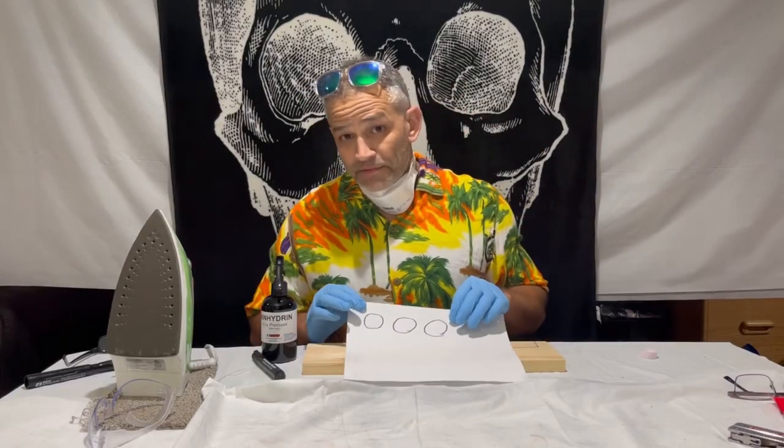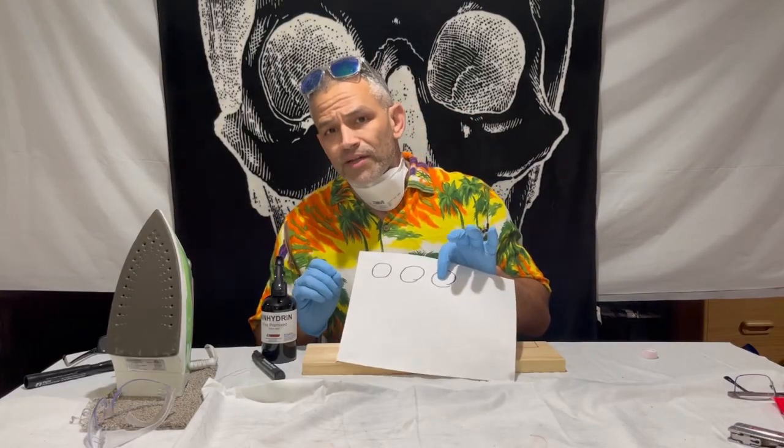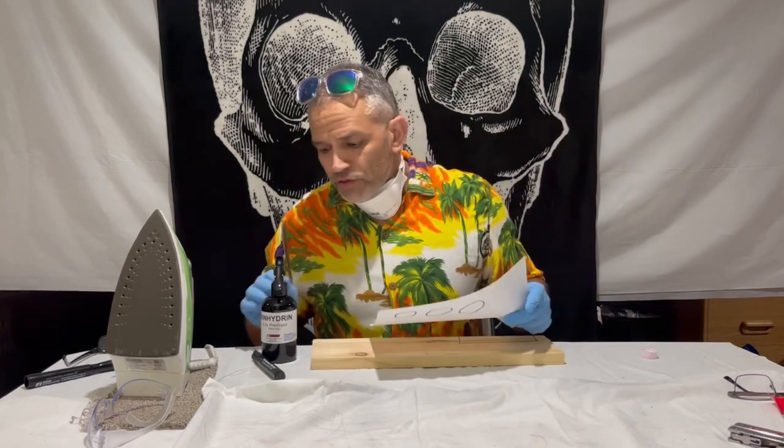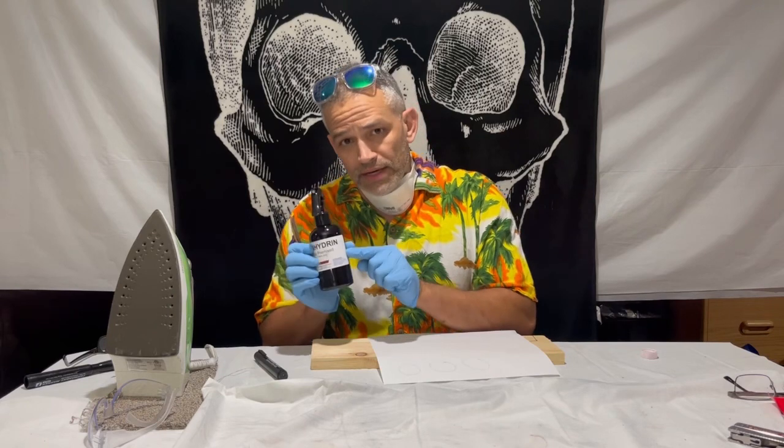Today we are going to develop fingerprints on porous surfaces — that's paper and unfinished wood — and we're going to do that using a chemical called ninhydrin.